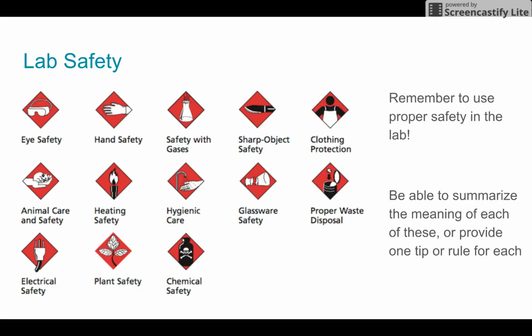Okay, just a note, I want to make sure that you guys remember the lab safety rules and that you can identify these lab safety symbols. You should be able to identify each symbol and summarize them or provide an example for each. And I will ask you to do this on a quiz in the future.